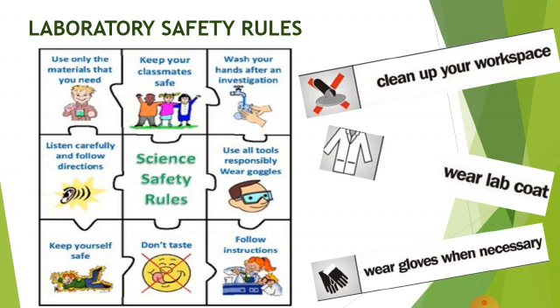Clean up your workspace. It should be done before the experiment as well as after the experiment. Wear the lab coat. It's good for the safety of your uniform, of your dresses. Wear gloves when necessary. When you are using your hands for doing the experiment, then it's necessary to wear the gloves.